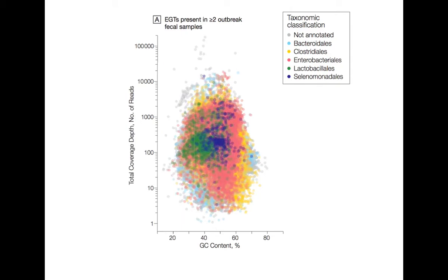And so this is a kind of census of what you see in this. If you take all those samples and you say what's present in more than one sample, as you can see, it's a huge abundance of different organisms. It's a right taxonomic mess, really.